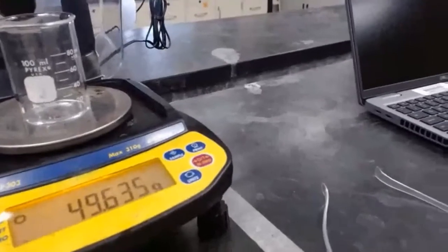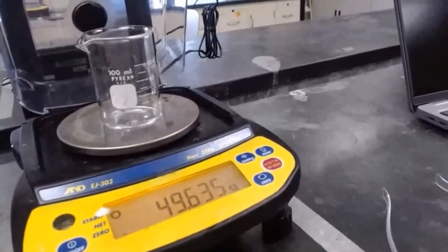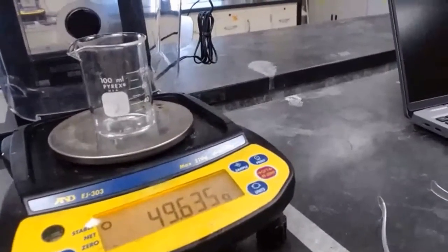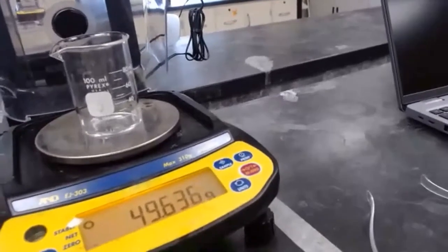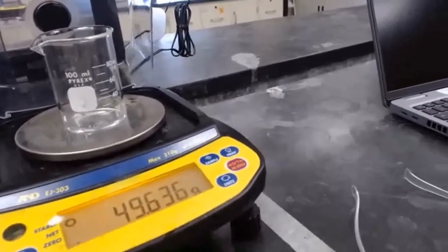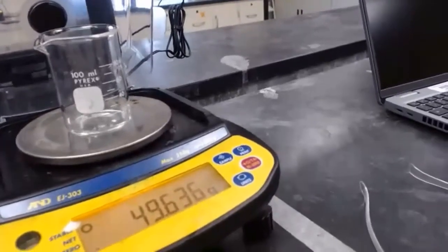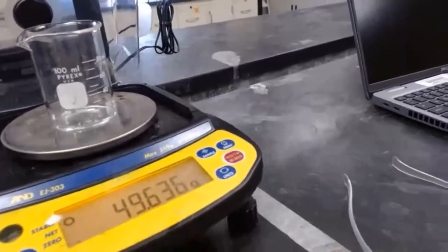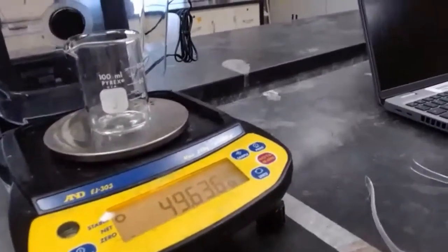And what you'll see on display are the digits. So you would record 49.635 grams. And there it just fluctuated to a 6. So I'm going to record 49.636 grams as the measurement for this 100 milliliter beaker.